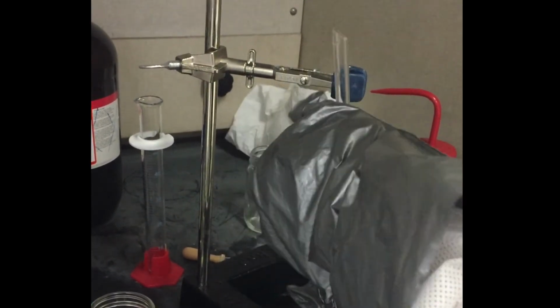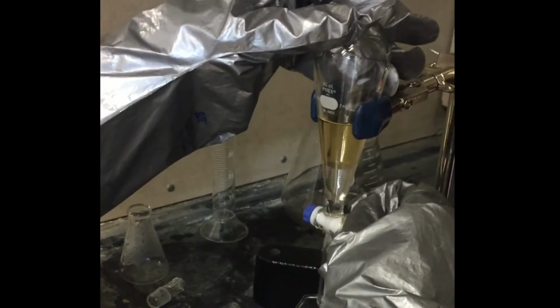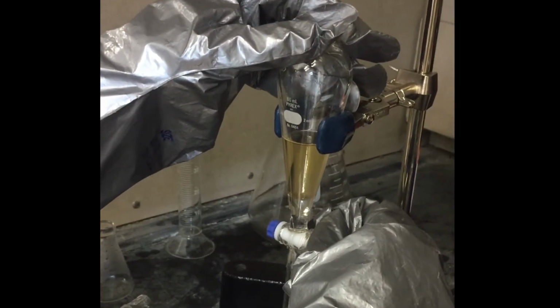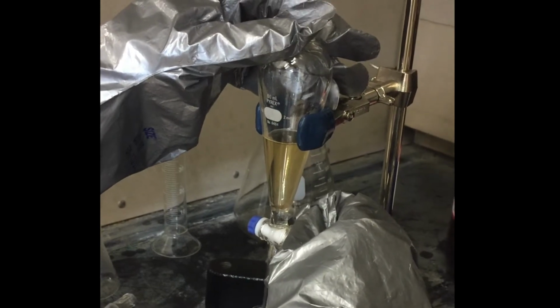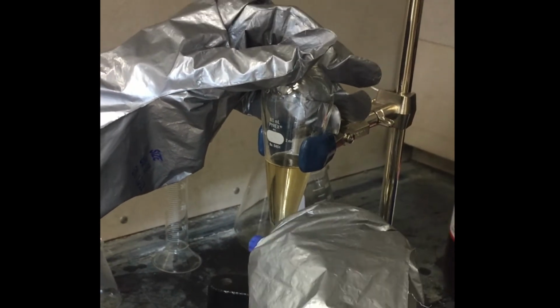After the final inversion, the flask is then placed back onto the ring stand and the bottom phase is collected in a beaker below. This procedure is then repeated 2 more times using the remaining coffee extract in an attempt to extract any residual caffeine that may still remain.